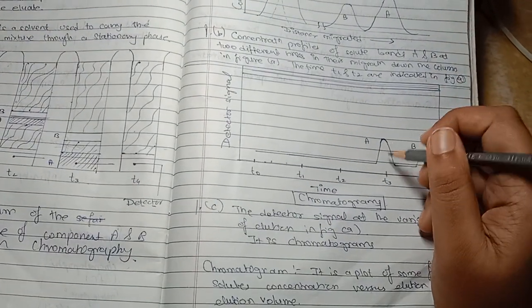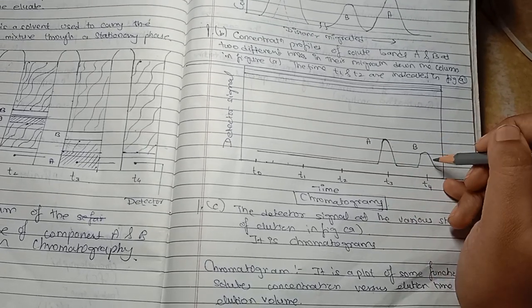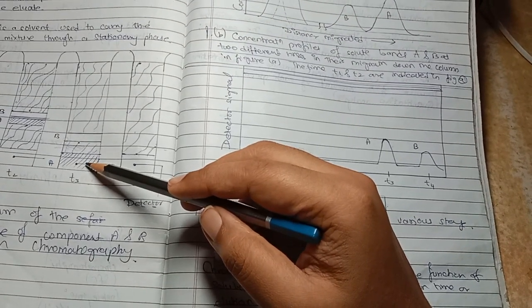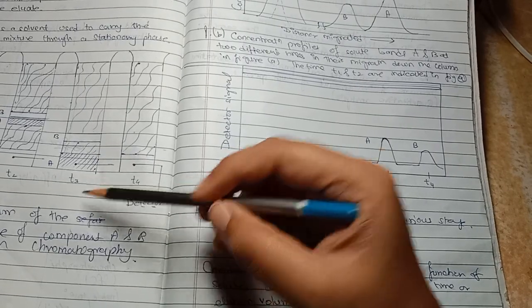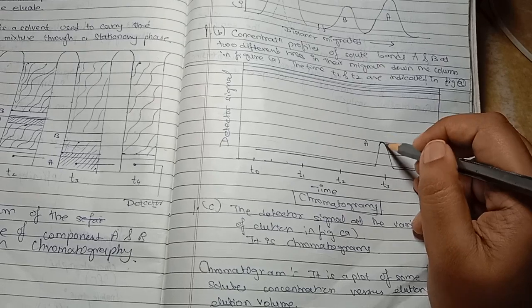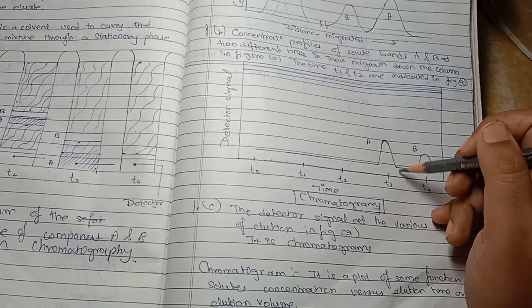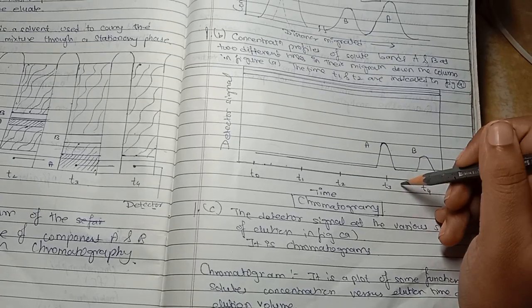So at time T3 component A was the first component to move out of the column, which means it is the first component to elute out of the column.